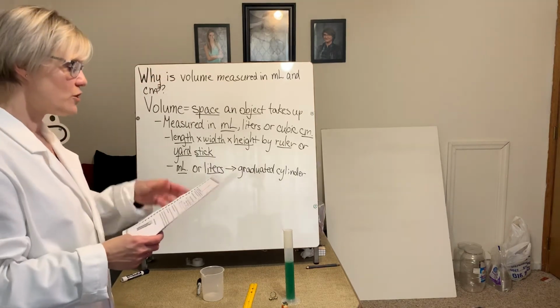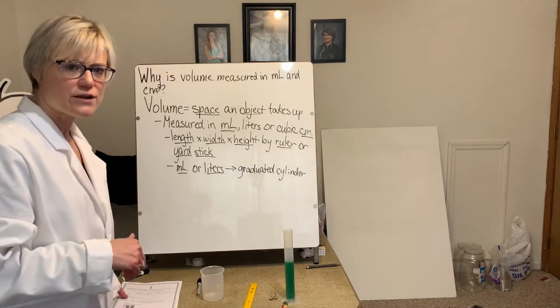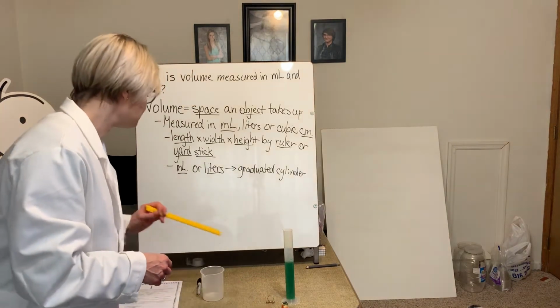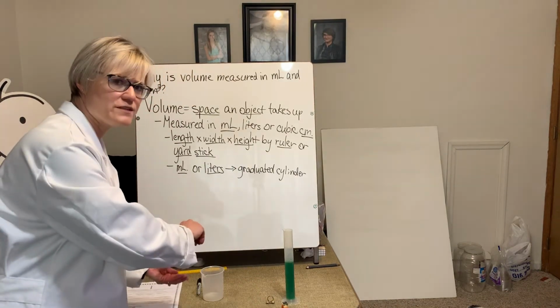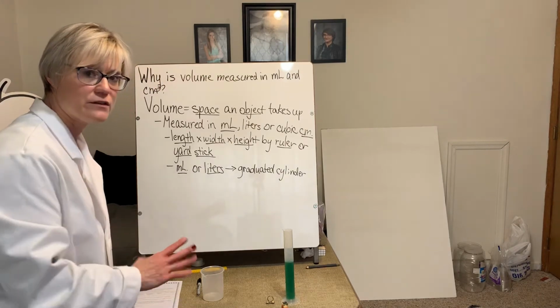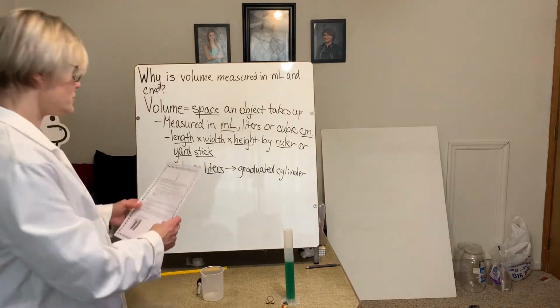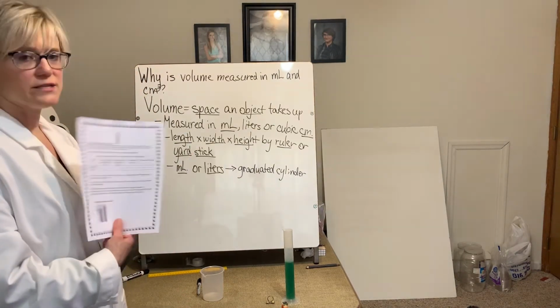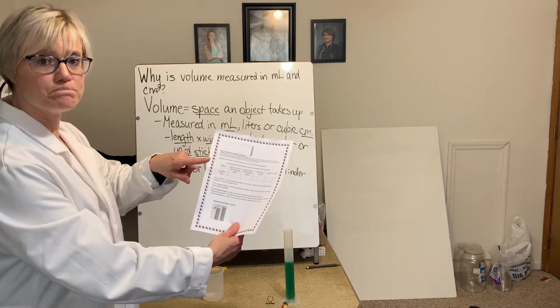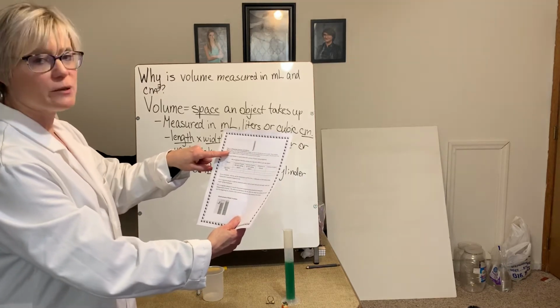All right, so we're going to use the graduated cylinder to tell how much water is displaced. So since I'm using two objects, I'm going to have to pour this out and then put it back in. So I'm going to have to reread to make sure it's accurate before I do the second object. So for the first object, and I'm looking at the chart on your interactive notes, and I'm looking at part 2.